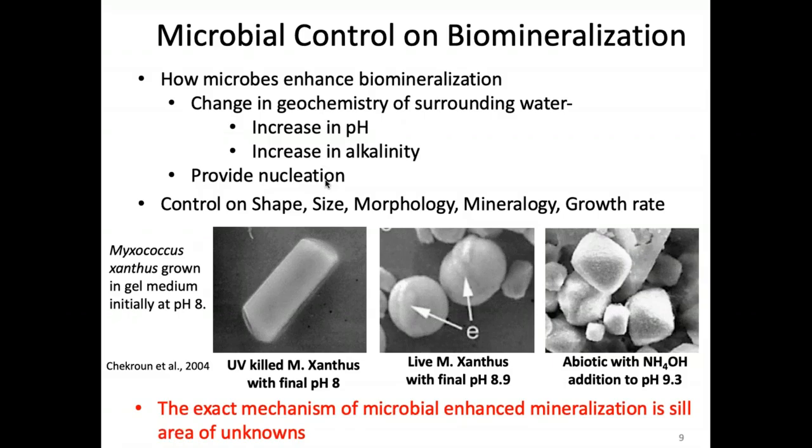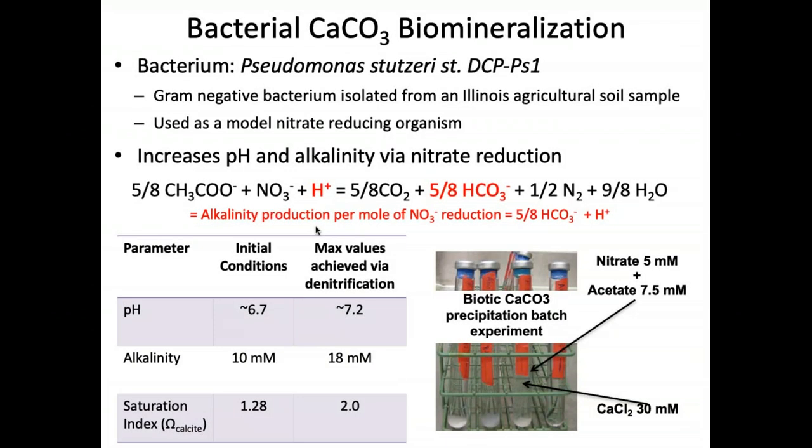While this knowledge is there, there is no consensus among people on what actually happens. Some people say it increases pH, some people say it changes alkalinity, or it depends on one or two or all of those factors. So there is a debate about that, and we wanted to study that mechanism: what is it that is causing the precipitation, using our microfluidic experimental setup, a micromodel.